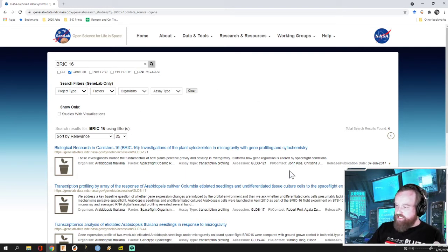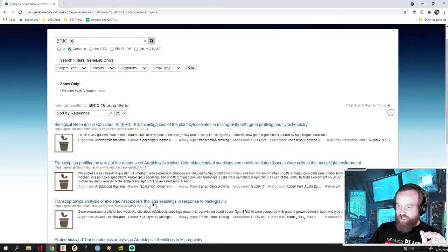So this experiment that we're doing was conducted by a colleague of mine, John Kiss, who's at UNC Greensboro. And John's been doing space experiments since the early 90s, so before most of you were born, likely. And so we're going to click here, but make sure, so there's multiple BRIC 16 experiments.